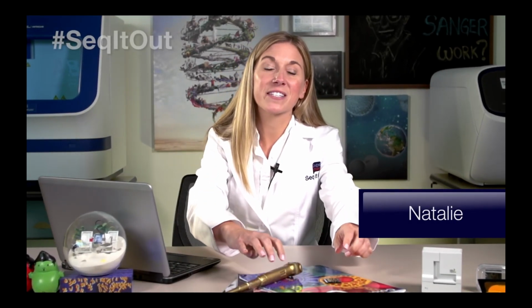Let's go back to the basics and explore the technology platform that has been regarded as the gold standard for many years. Yeah, you guessed it, I'm talking about Sanger sequencing by capillary electrophoresis.